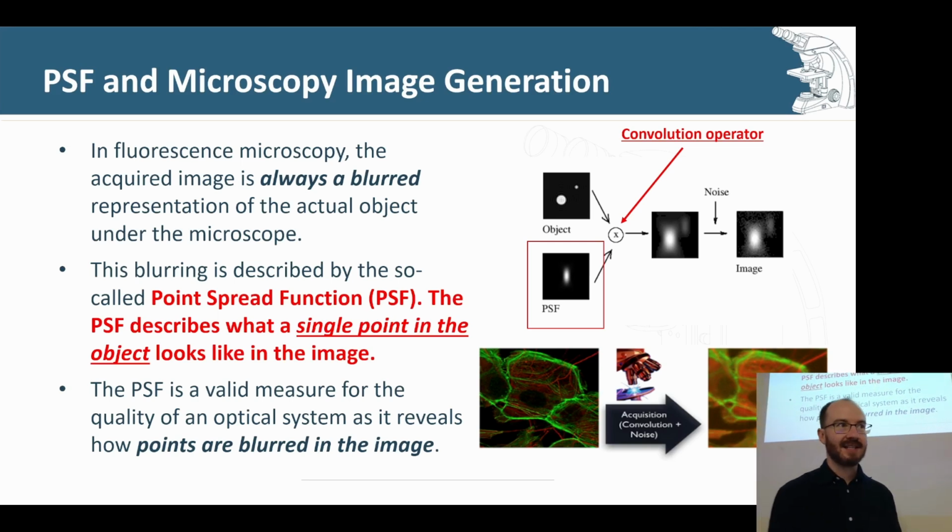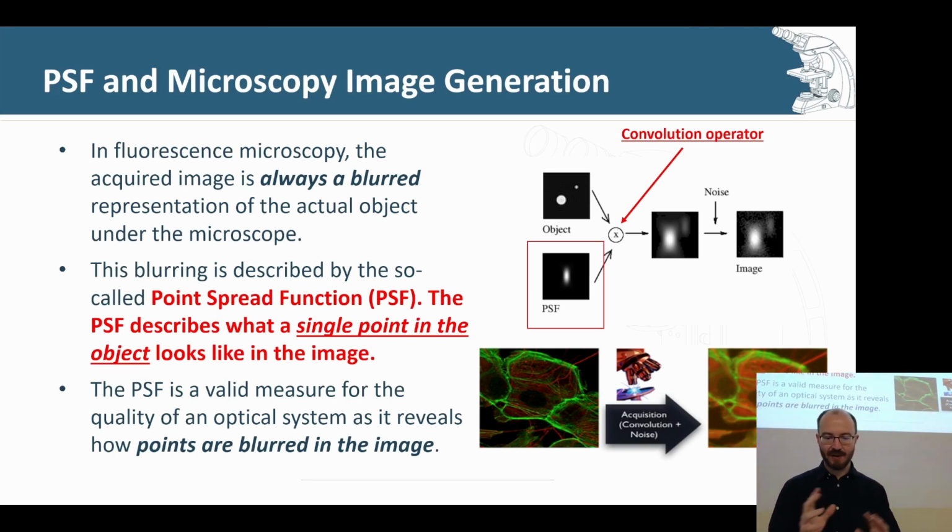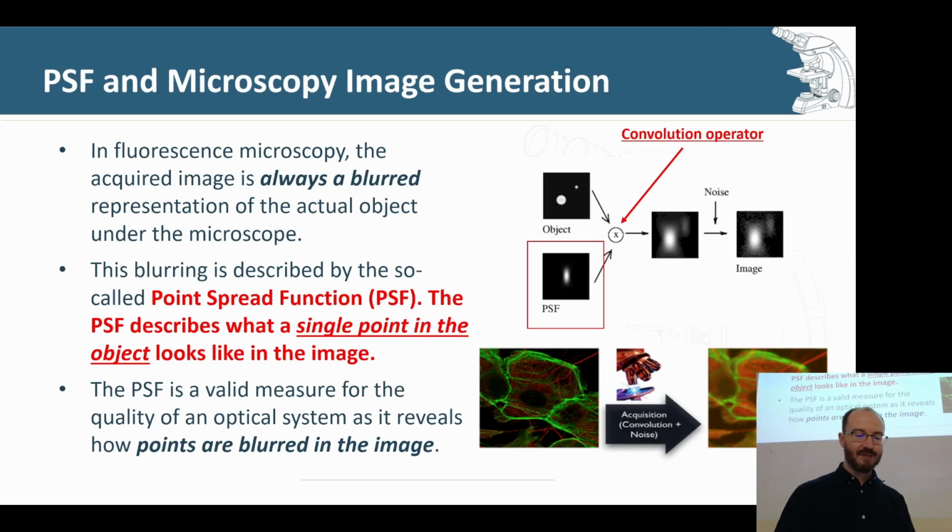In the process, there are a lot of lenses that it goes through. Light refracts, and different wavelengths of light refract differently through a lens. There are also some distortions that a lens can introduce. No lens is perfect, and no refraction is exactly how you would expect it. So it's not really noise as much as a blurring or a non-specificness that enters into your image due to the refraction through the lenses, and it not ending up very clean on your sensor the way it was actually imaged.